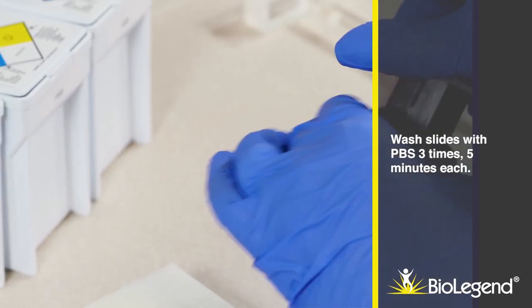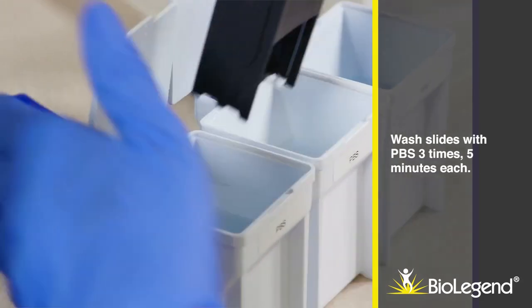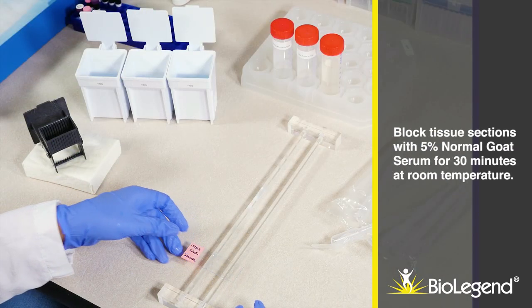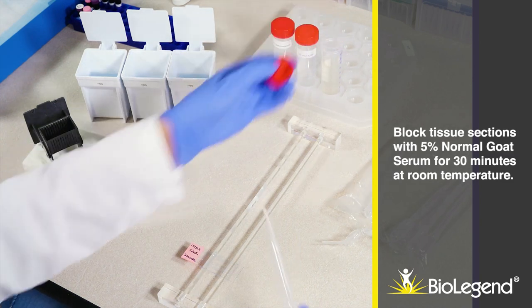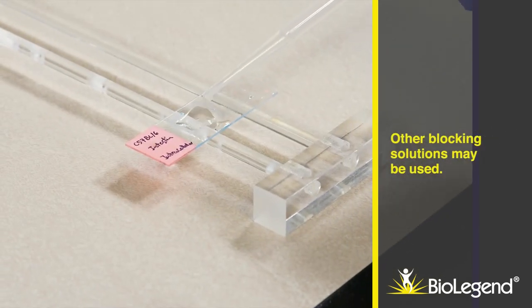Wash slides with PBS three times, 5 minutes each. Block tissue sections with 5% normal goat serum for 30 minutes at room temperature. Other blocking solutions may be used.